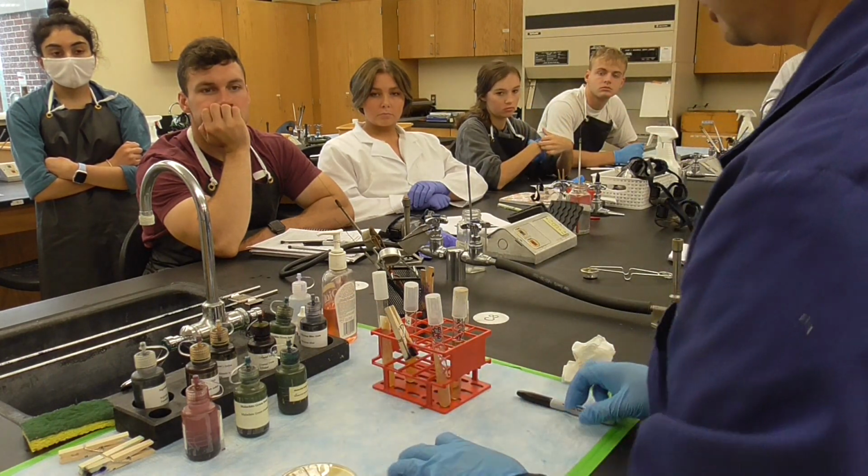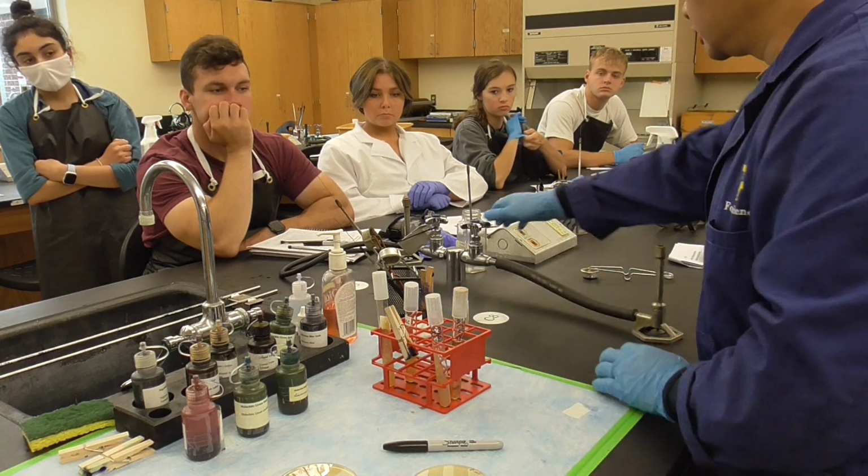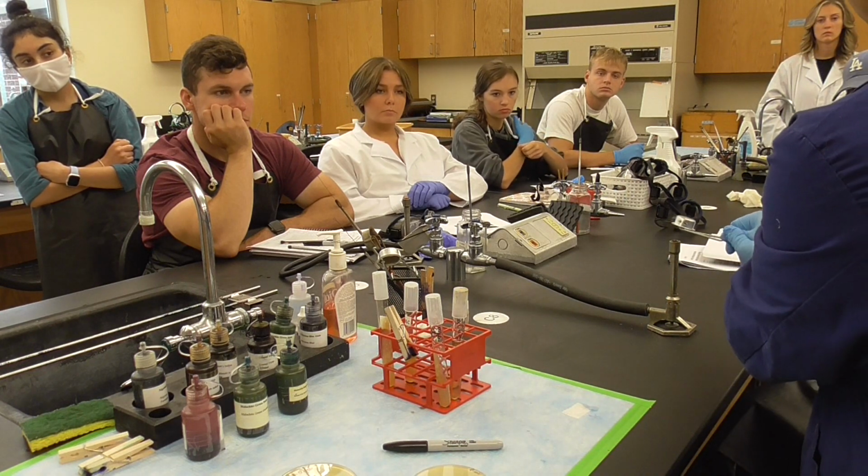So first of all, let's do the transferring bacteria. This you absolutely need a Bunsen burner, but don't need a goggle. Okay, and there's no dye there.